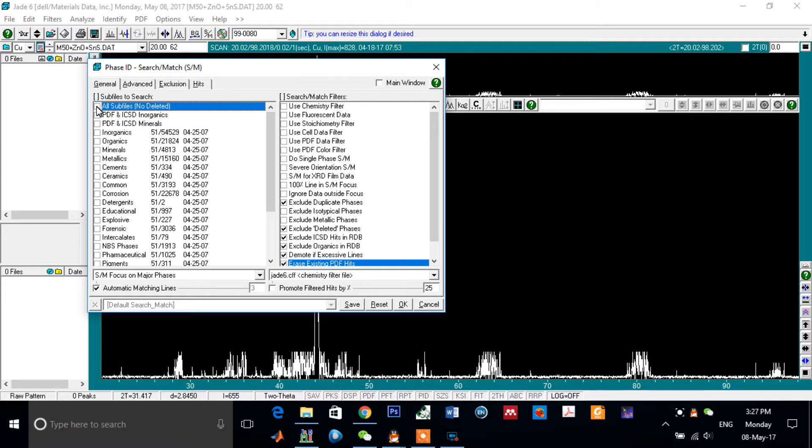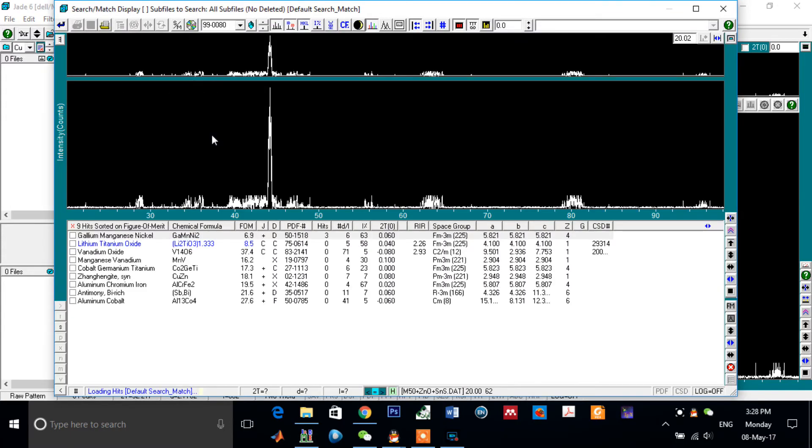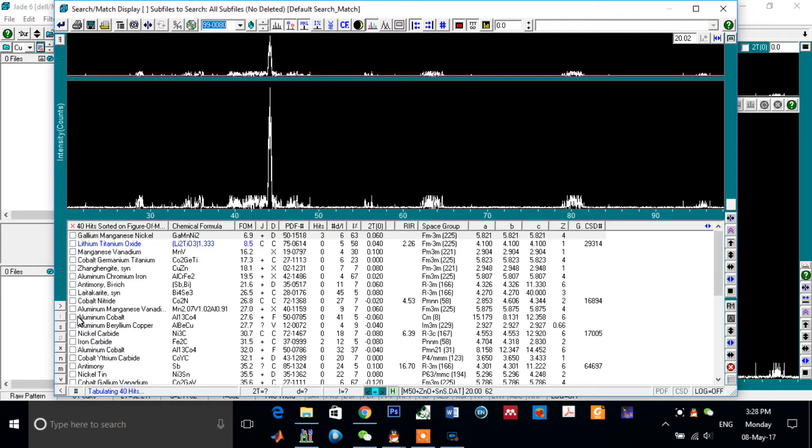From this window, if you don't know too much about your sample, no problem. Just check this box to select all subfines and click on OK.